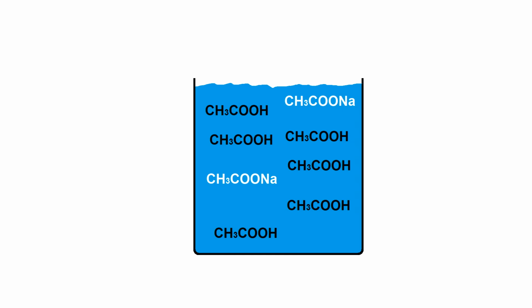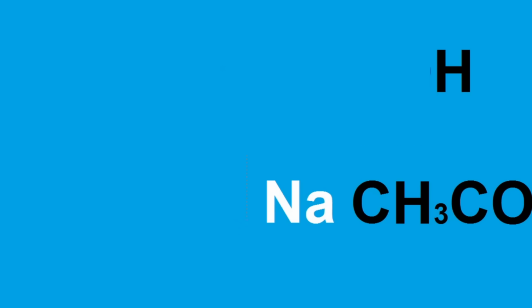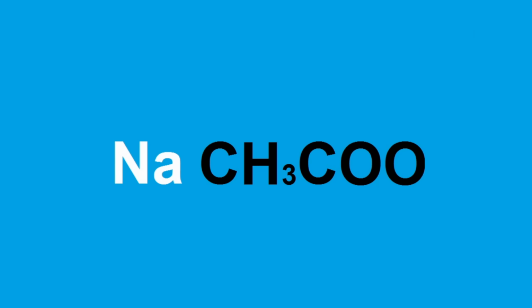So to avoid that, the sodium acetate is in a healthy excess of vinegar so that as the acetate ions are consumed off the sodium acetate, the lonely sodium goes and grabs another one from the acetic acid. At least that's how I think this all works. I really have no idea what the hell I'm doing, to be honest. Let's start by making the electrolyte.